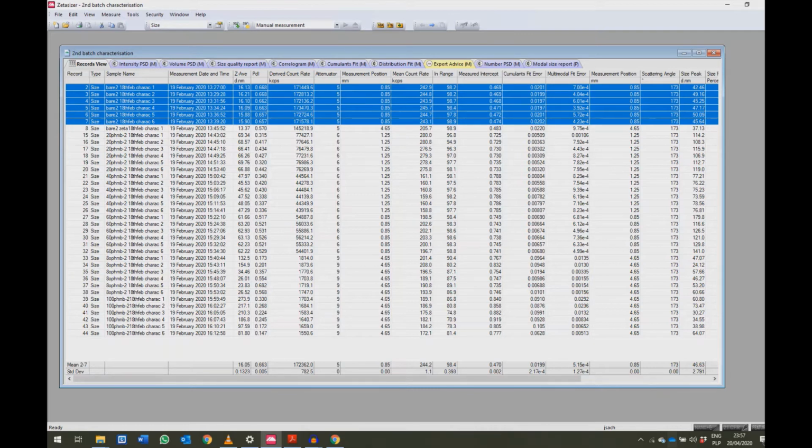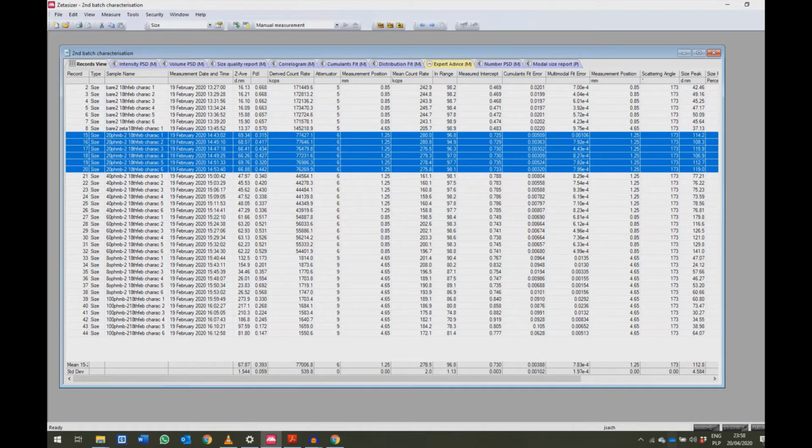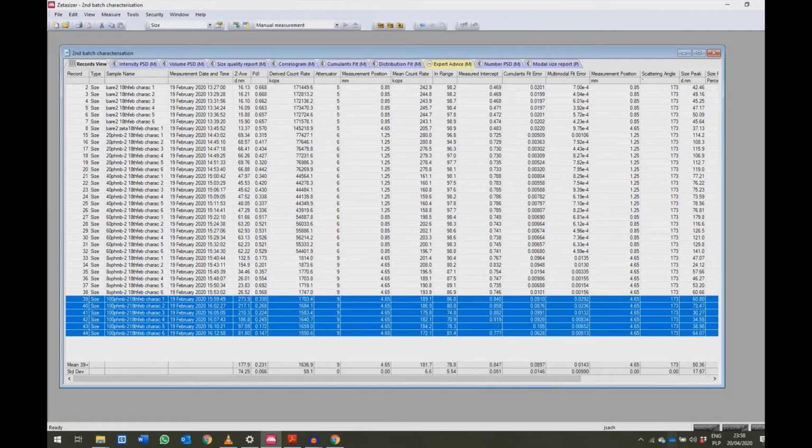So for example, if you look at the bare silver nanoparticles, or even the 20, the standard deviation is fairly small. We're talking about singular items that are deviating there. But actually, when you look at 100, this deviation is a lot bigger. So that is a suggestion that there is something happening over there.